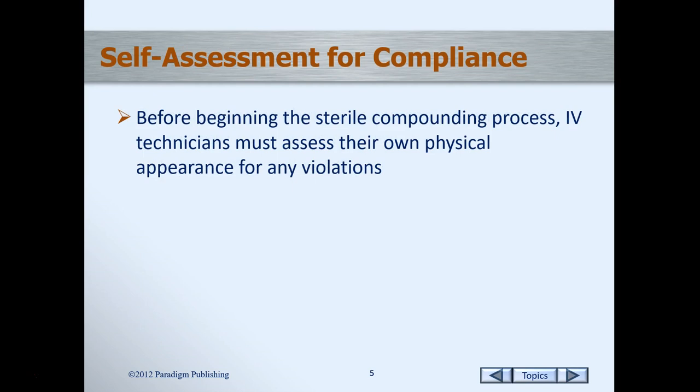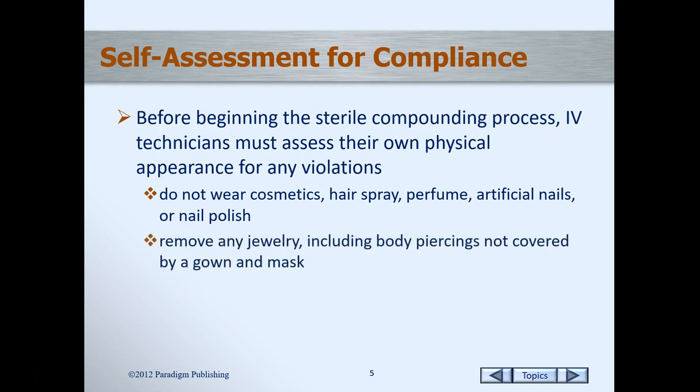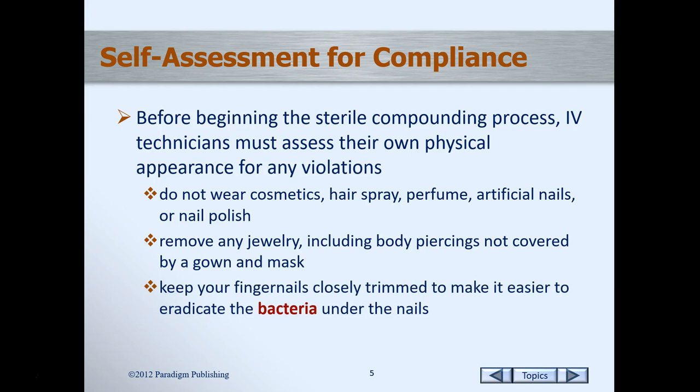Before beginning the sterile compounding process, IV technicians must assess their own physical appearance for any violations. You should not be wearing any cosmetics, hairspray, perfume, artificial nails, or nail polish. All jewelry should be removed, including body piercings that are not covered by a gown and mask. Fingernails should be kept closely trimmed to make it easier to remove the bacteria from under the nails, approximately 2 millimeters in length. You should have no weeping sores, sunburn, rash, or respiratory infections.